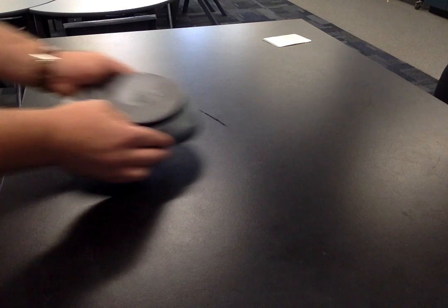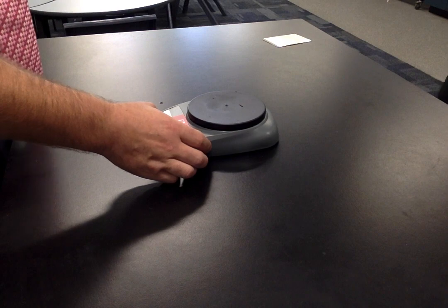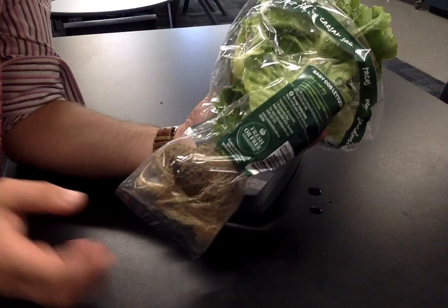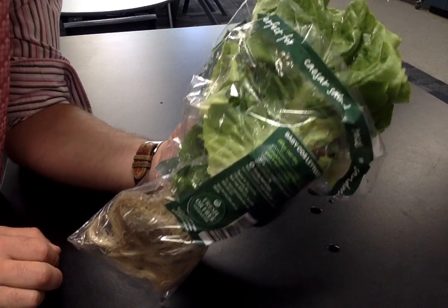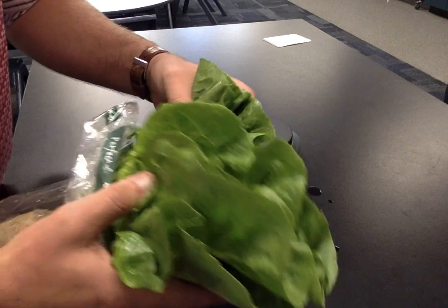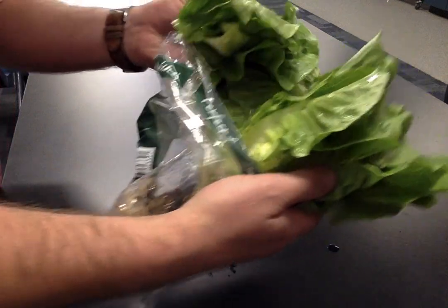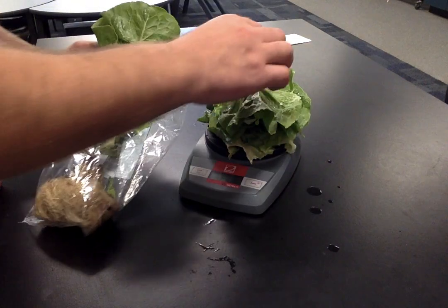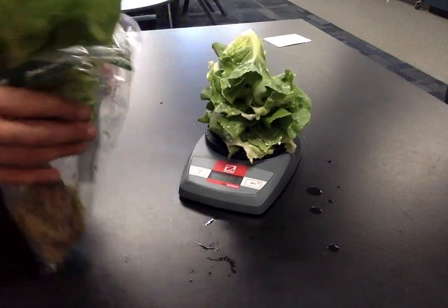Next we need to introduce some lettuce. Weigh out 100 grams of whole salad leaves using an electric scale. We've got a whole lettuce here — still got the roots attached, so it's essentially a live plant. I ripped off some of the leaves near the roots to about 100 grams. A little bit over, but I think that's because they're wet.